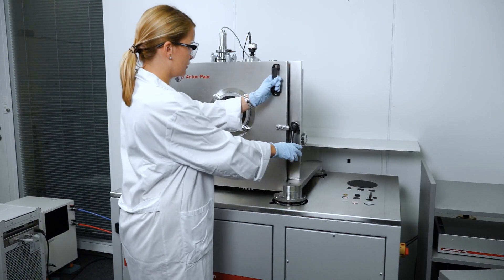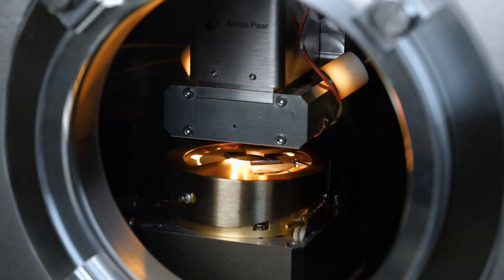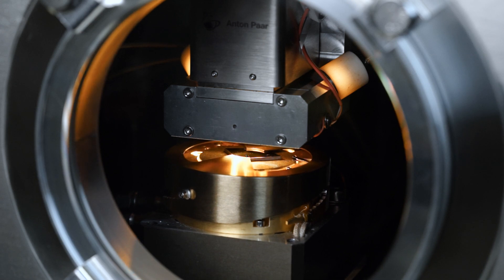After the system is closed, the indenter, the reference tip, and sample can be heated, and the measurement can start.